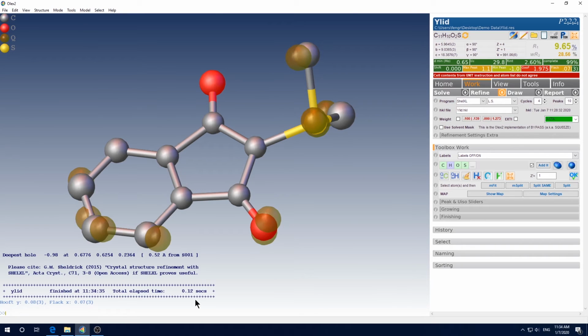All this will tell the program to refine. I personally prefer keyboard shortcuts, but you can do whatever you like. Refine a couple of times until the shift value stabilizes. It may not approach 0 at this point. In this case it does, but it may not in other cases. Don't worry, at the end of this tutorial, it will get to 0. At this point, you just want it to stabilize.